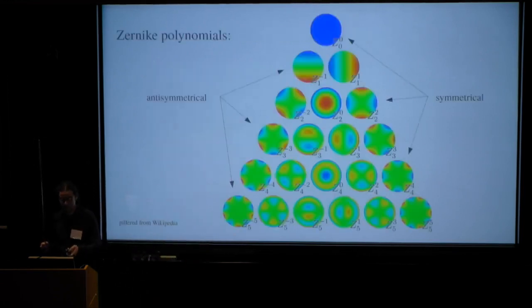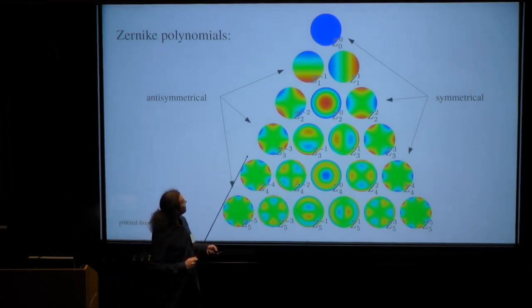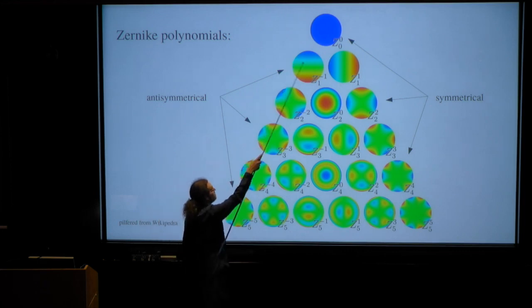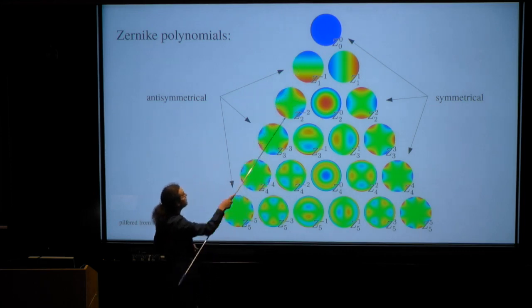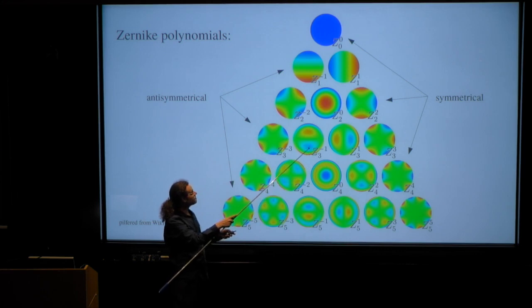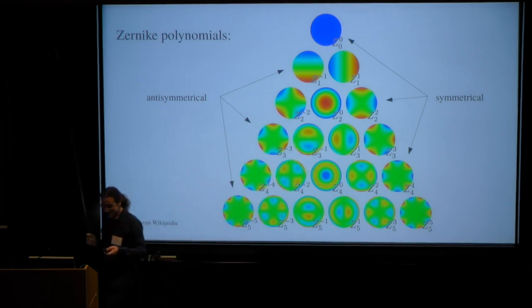Now, more importantly than the fancy new model, these are the polynomials, by the way. There's nothing very special to them. We don't use their orthogonality, but they come in even and odd bands, which are either anti-symmetrical or symmetrical. The frequency increases, as does their number, and they come in pairs. So by constructing linear combinations of corresponding functions, we can rotate them into any angle.